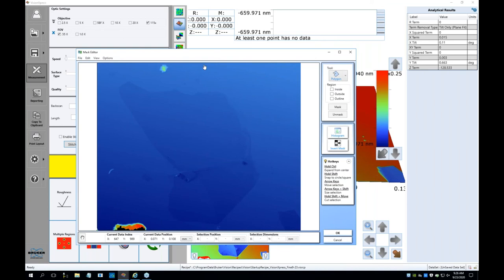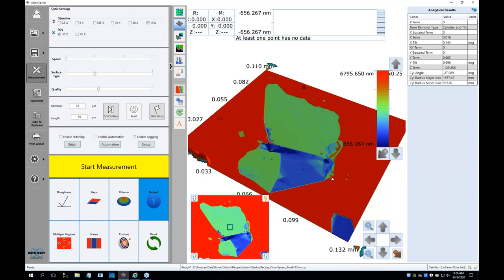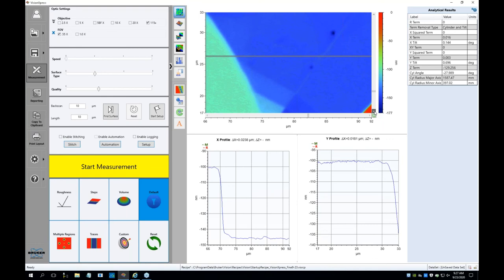So we can define a nice big area around, and make sure that we determine a reference region, a bit like whenever we were in dissolution, we were getting some reference surfaces. And now here we go, you nicely see the graphene layers in the different terraces. If we want to check further, we can see a top view, and we can zoom in on these interesting areas, where we nicely see specific terraces.